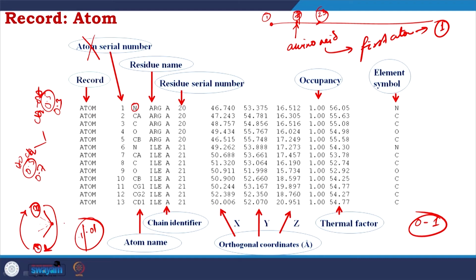But if you develop a better software, you could identify other conformations, which would be invaluable in understanding the dynamic nature of that residue. You understand what I mean? So, you could not only identify two conformations, you could also identify the transitions and some other conformations which take an important part while this transition is happening. So, that is the importance of occupancy.